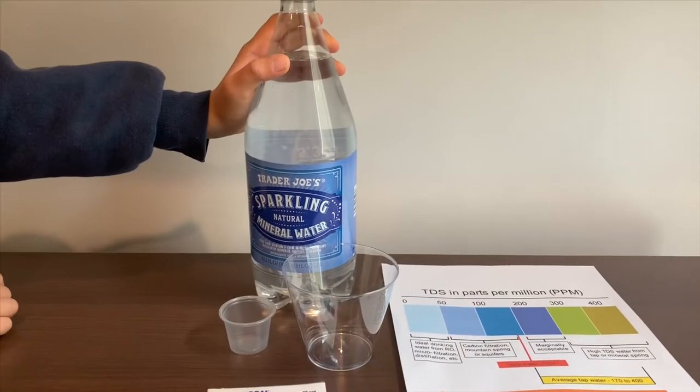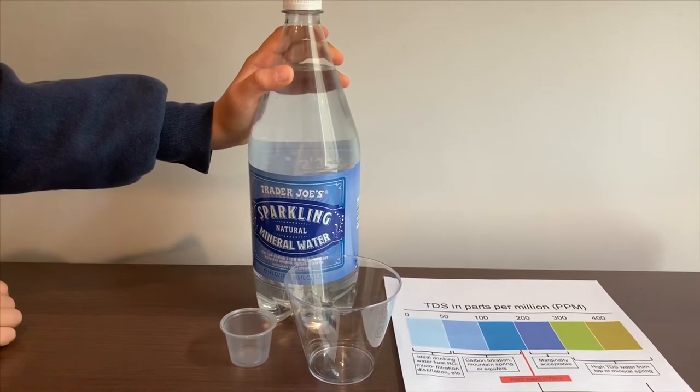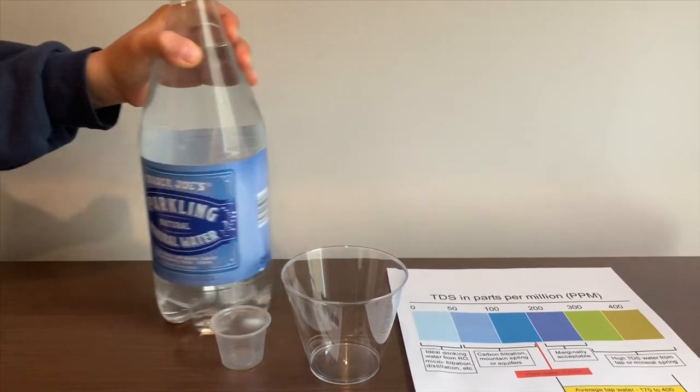This is Trader Joe's Sparkling Natural Mineral Water. It costs 99 cents and is sourced from California. Let's test the pH and TDS level.